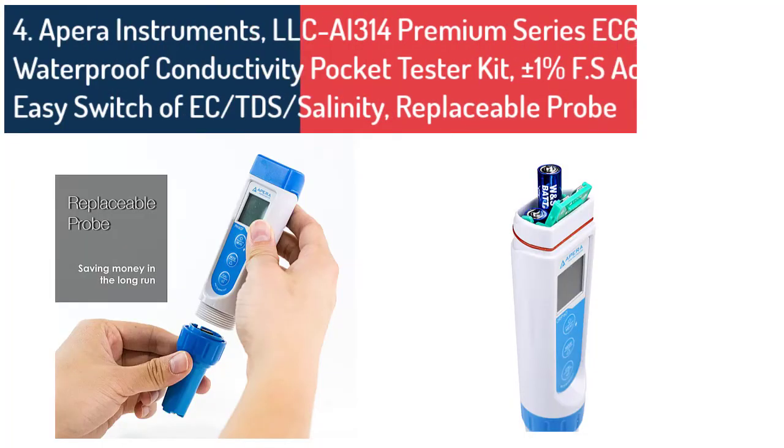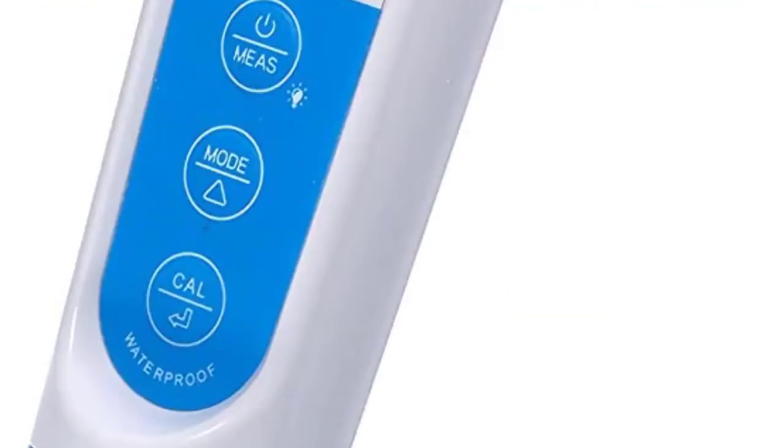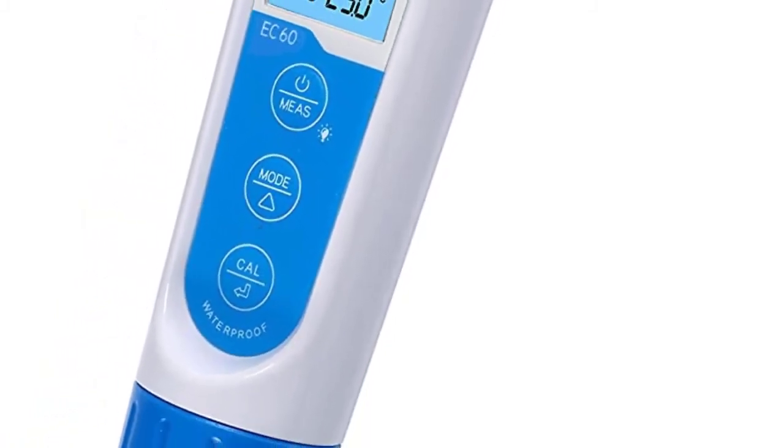Number 4: Water Quality Tester by Hone Forest. To achieve high accuracy, it is equipped with a premium quality titanium alloy probe and reliable Automatic Temperature Compensation (ATC), which ensures readings are always accurate at various temperatures.